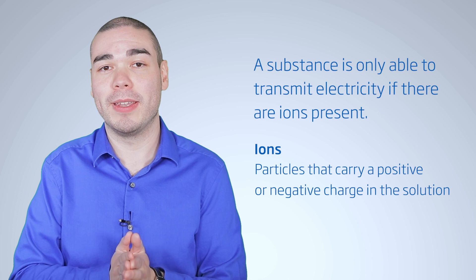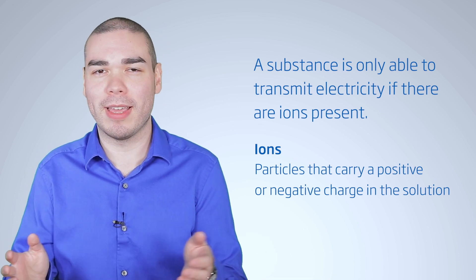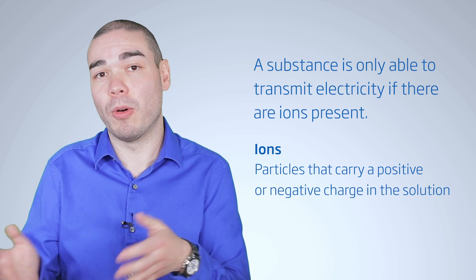A substance is only able to transmit electricity if there are ions present. Ions are particles that carry a charge, either positive or negative, in the solution. So for example, if you had a water sample and dissolved a bunch of sugar in it, the EC measurement would not change much. This is because sugar does not break apart into charged ions.